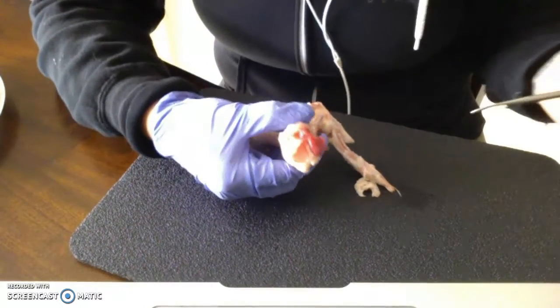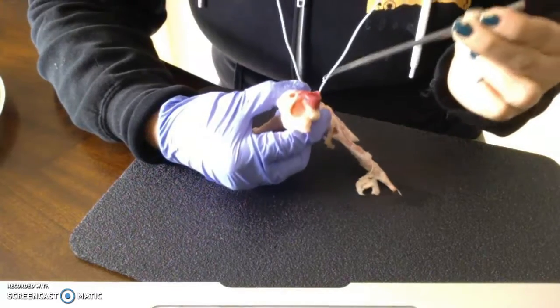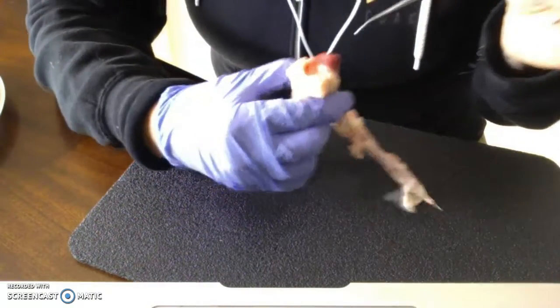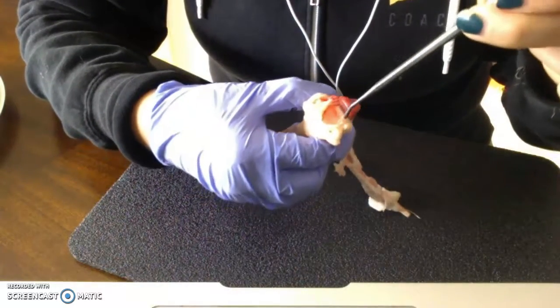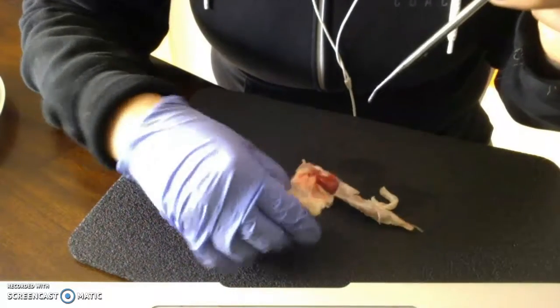What we have here, this red smooth area, is our synovial membrane. In here is where we would have our synovial fluid, and you can still see just a little bit right here. This is our articular cartilage on this side, white and smooth.